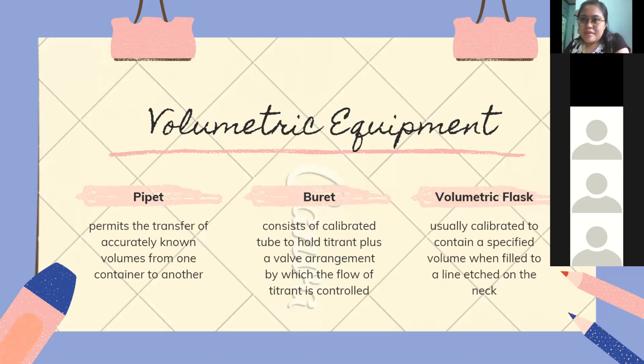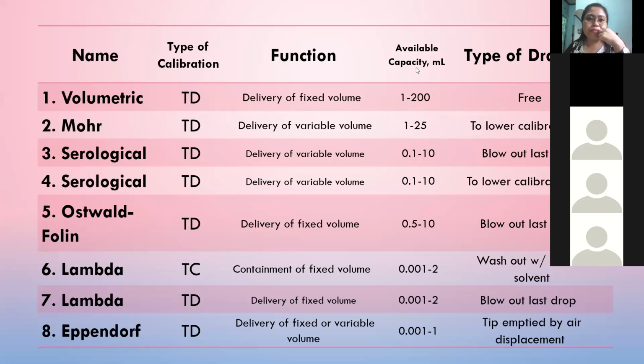And then the last one, we have the volumetric flask class, na ginagamit siya to most likely to contain, okay? To contain ang ato ang volumetric flask, it's a flask with a long neck, and then you can only see one graduation etched on the neck of our volumetric flask. So it will just give you one measurement only. So again, this is to contain solution, especially if we want to make a stock solution. Well, let's start with the using of the pipettes.